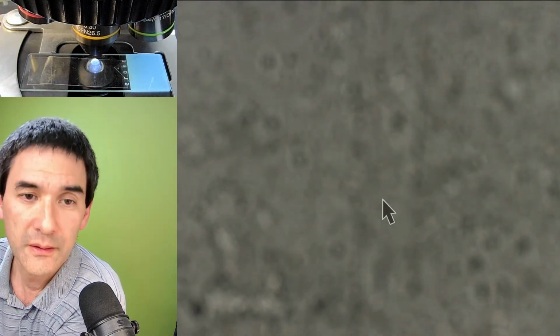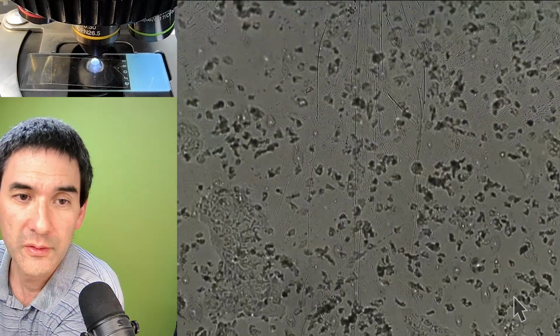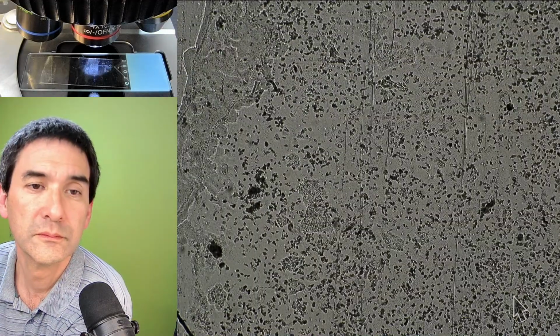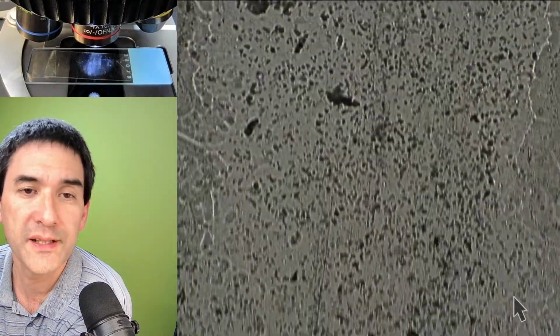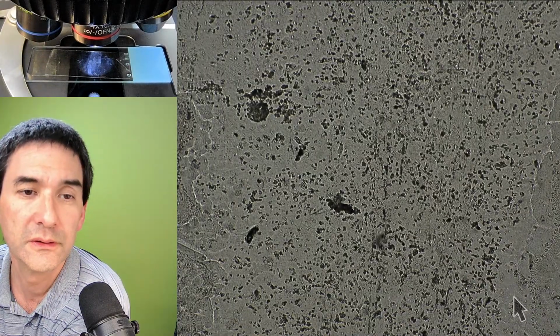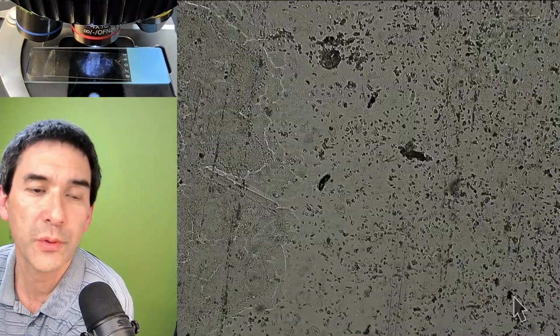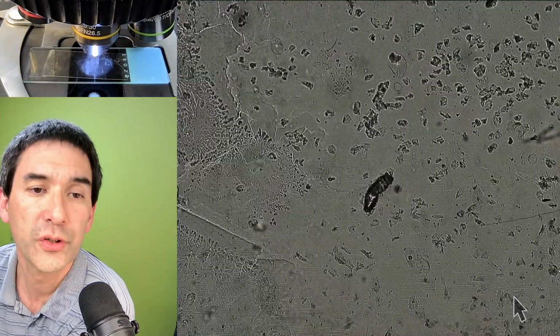Okay, let's move the arrow again away here. So again, you see a high density of cells here. What we're going to be doing is we're going to have a look again at those dark, larger structures.